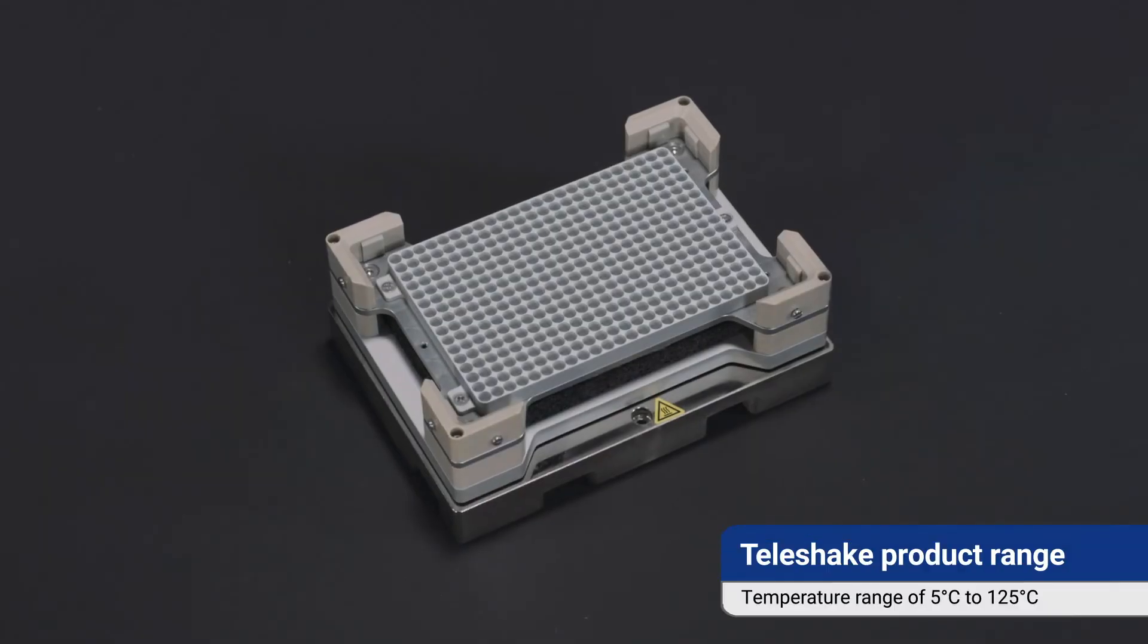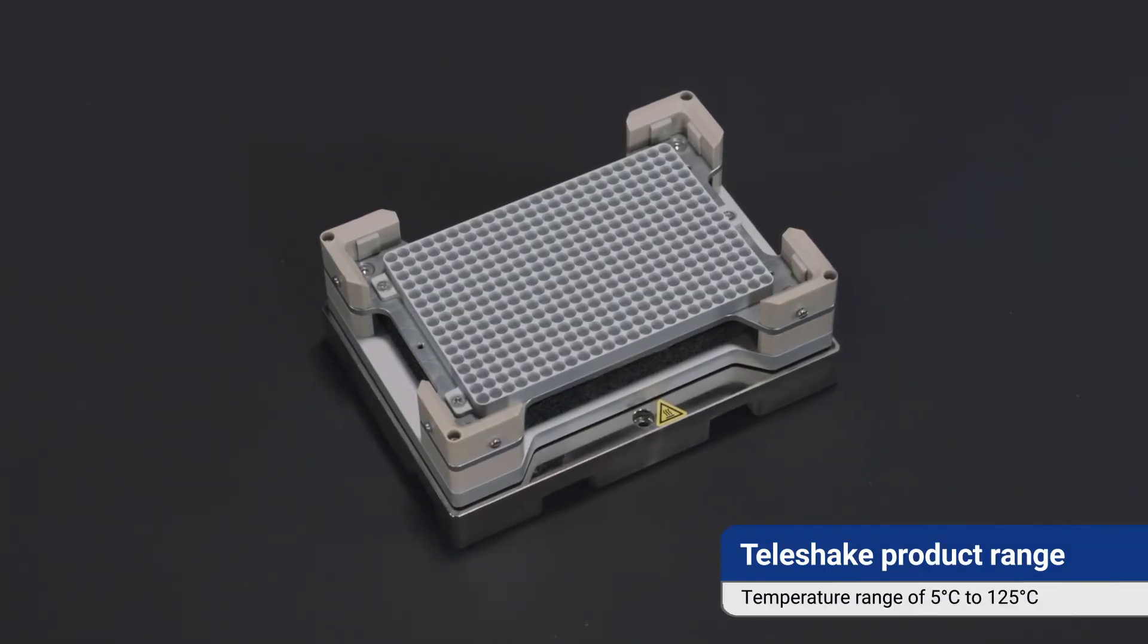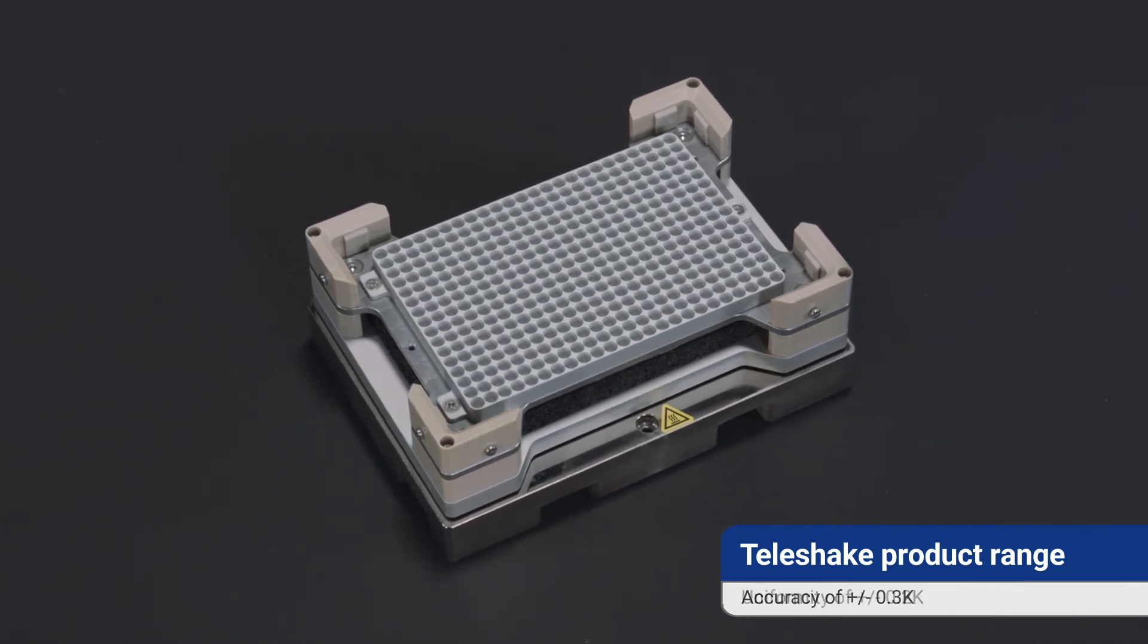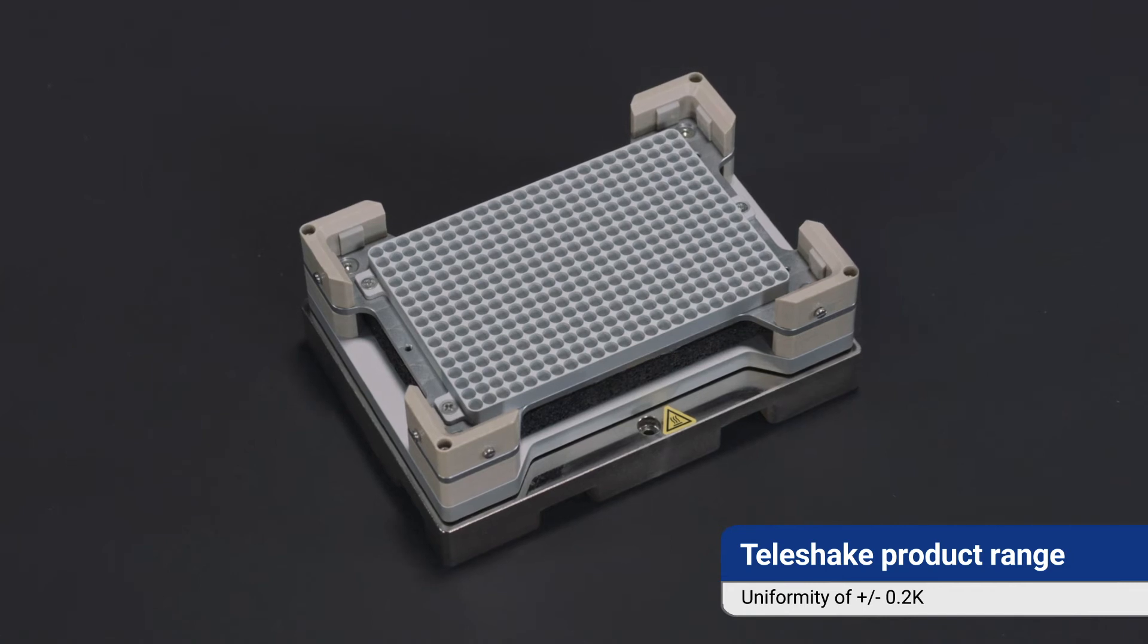With a temperature range of 5 degrees Celsius to 125 degrees Celsius, accuracy of ±0.3 Kelvin and uniformity of ±0.2 Kelvin, Inheko offers a huge range of options to cover your needs.